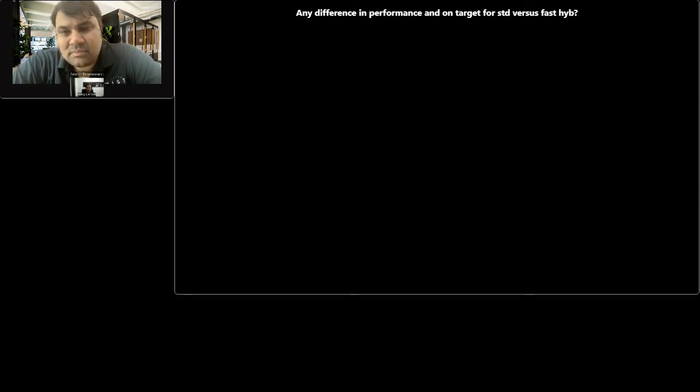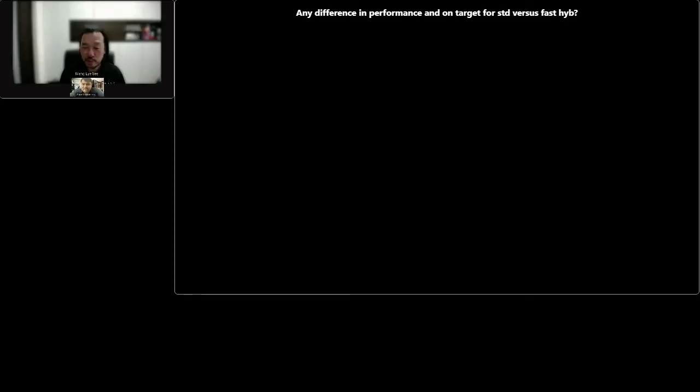Thank you. More questions coming in. Do you optimize Exome 2.0, I assume, on the DNB-seq platforms of MGI?